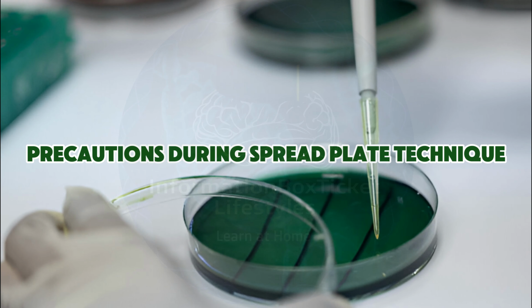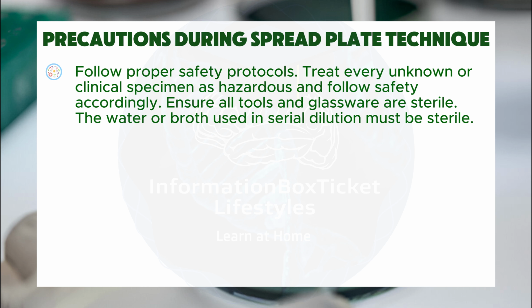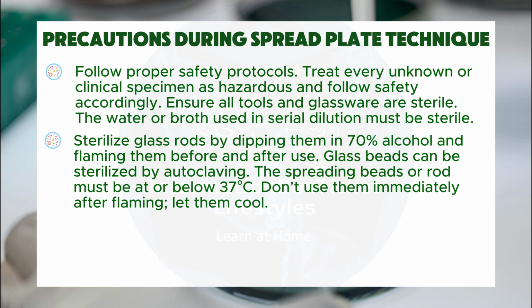Precautions during spread plate technique. Follow proper safety protocols. Treat every unknown or clinical specimen as hazardous and follow safety accordingly. Ensure all tools and glassware are sterile. The water or broth used in serial dilution must be sterile. Sterilize glass rods by dipping them in 70% alcohol and flaming them before and after use.